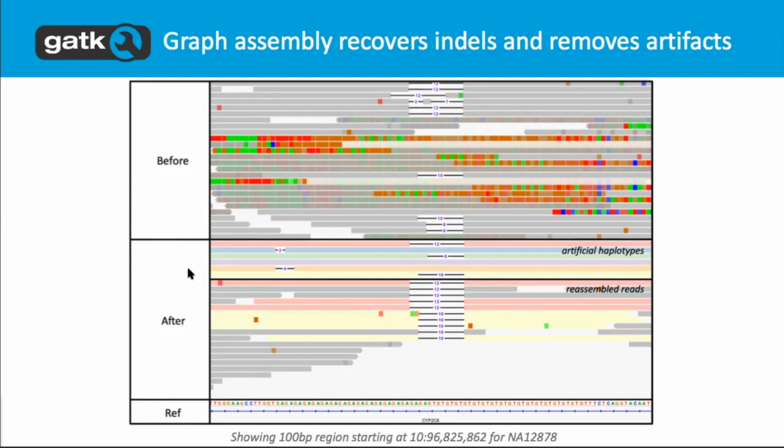This is something we do for both germline and somatic short variants. And you'll see tomorrow morning that Mutect2, the somatic version of HaplotypeCaller, uses the same code under the hood to do the exact same thing. Yeah?